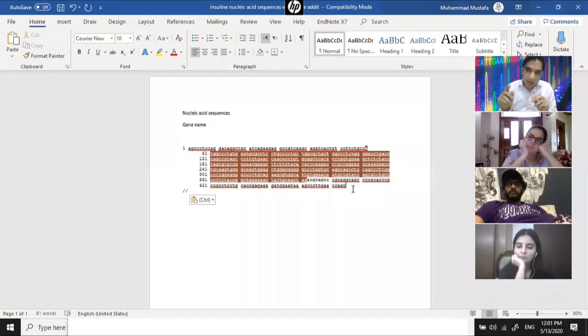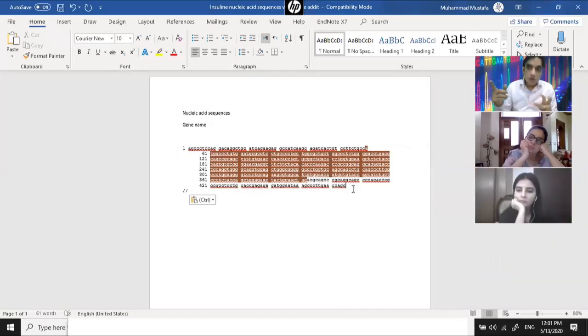They have no idea there exist codons. They have no idea they should be translated into amino acids. So all these things Microsoft Word cannot understand because it's a language word processor. If you change or delete one particular thing here, you will not be able to understand what actually happened to the gene. So this is the most inefficient way of keeping DNA records.